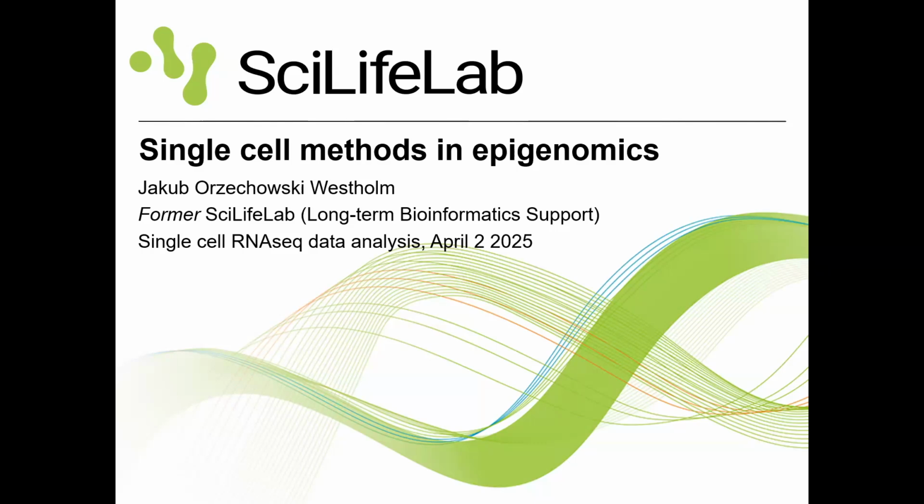So what you combine between cells to avoid the sparsity is the common peaks, or what? Yes. If you combine all the data, you will find the common peaks, and can also find peaks that are cell type specific, but it will be harder to pick up those, especially if you have some very rare cell types. So what you can do is that once you've identified your cell types, you can go back and redo the peak calling on just those cells, and maybe you can find something more.